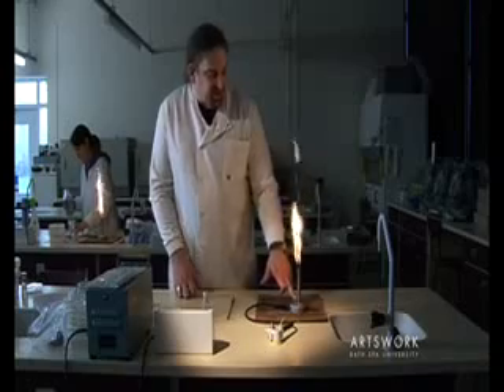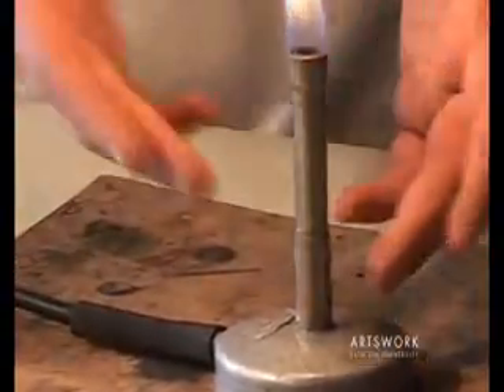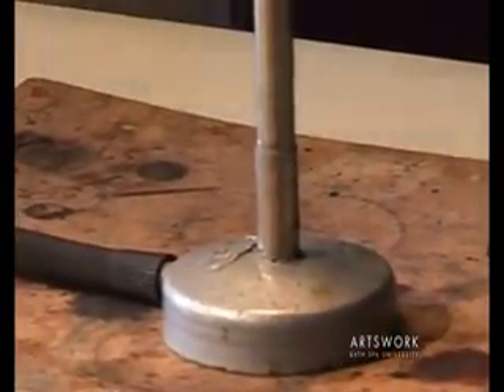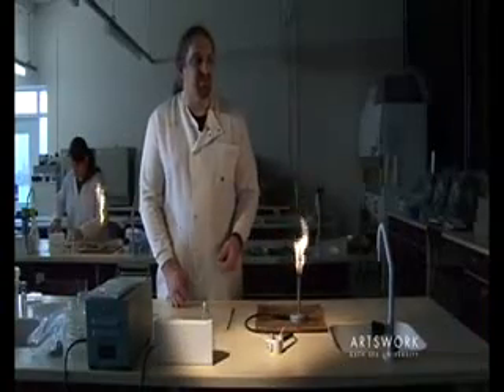We control the flame by using the revolving metal collar at the base of the Bunsen burner. When it's revolved so that the air hole is blocked, the lower rate of airflow produces this much cooler yellow visible flame.